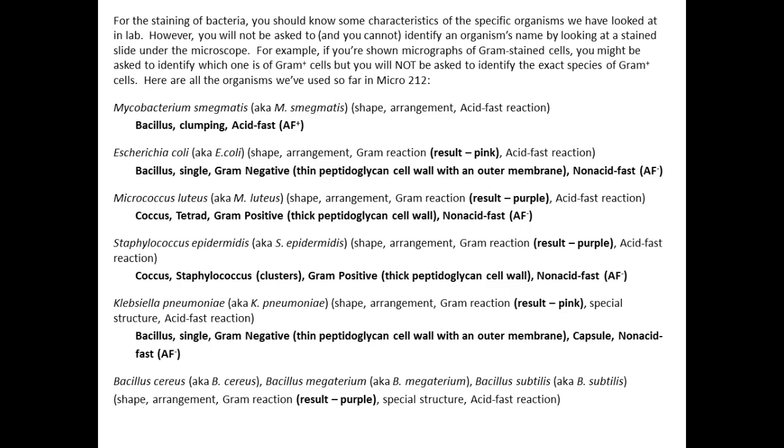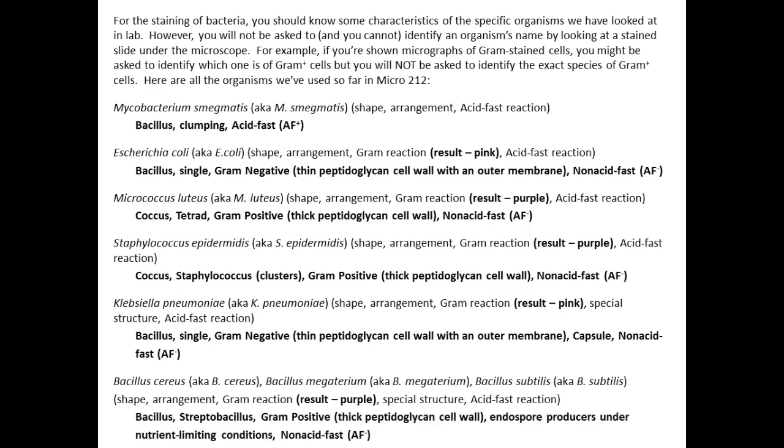Bacillus, as the name implies, what shape are these? Rod-shaped. And most of them form chains, so that would be streptobacillus. If you were to gram stain them, they would come out purple, so they're gram positive, and all of them would be what for the acid fast stain? Non-acid fast. And the reason why we're using these today is, what special structure do these bacilli produce when they're starved? Endospores. Each table will have a different species of bacillus that's an endospore former, so make sure you indicate which one your group has on your sheets today.